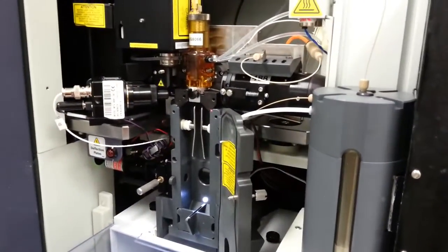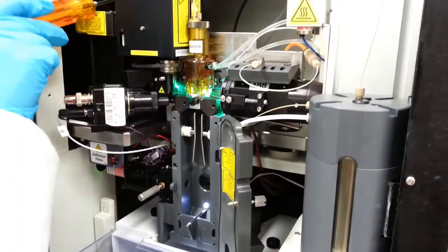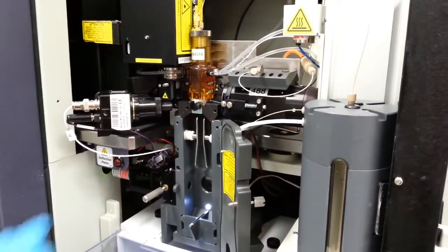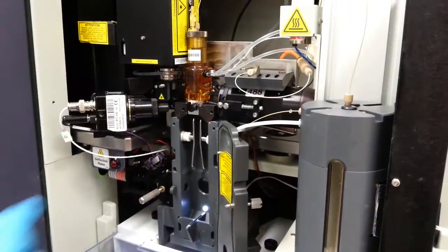So the cells come through in single file. Right here, you've got a whole bunch of lasers. I'll just demonstrate the lasers.